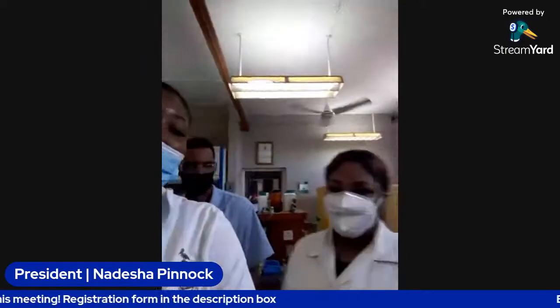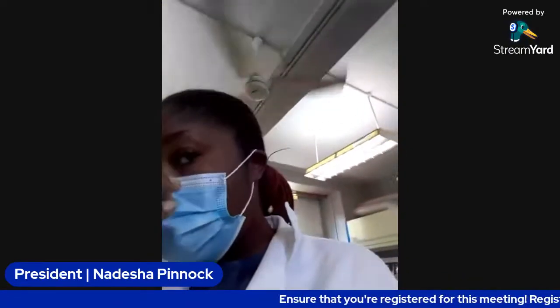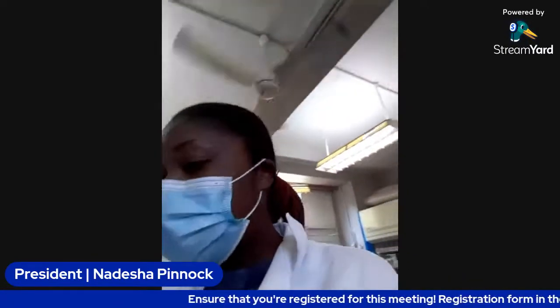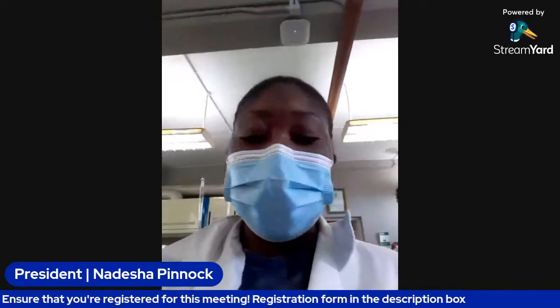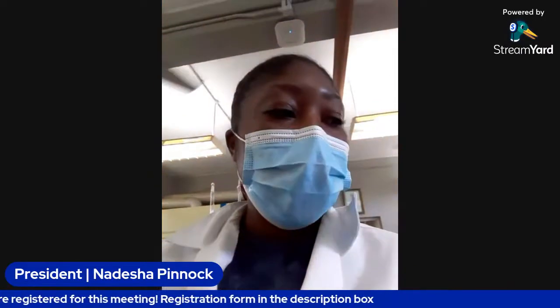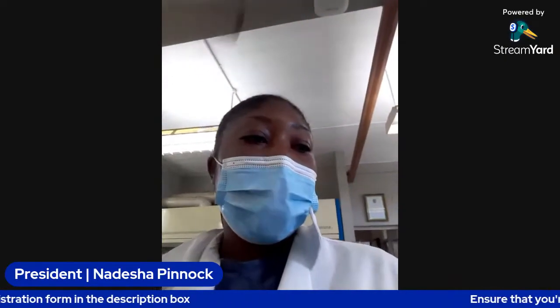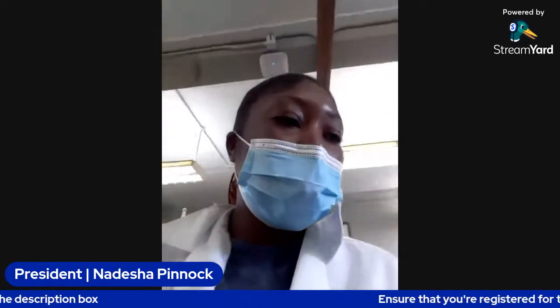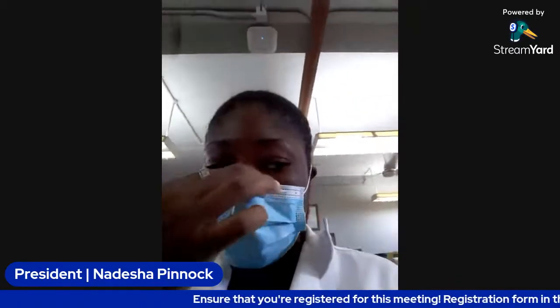Hi. Alright, so today guys we will be doing some food tests. We will be testing for macronutrients, that's carbohydrates, proteins, and lipids. So we'll be using a number of food items like sugar, glucose, milk, cheese, etc. to test for the different macronutrients.